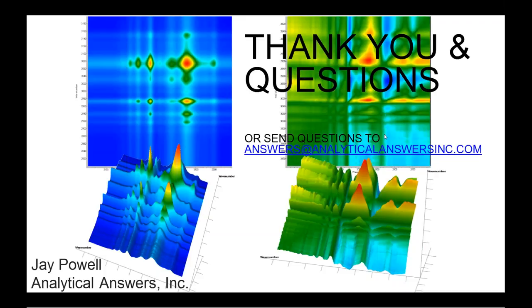I'm not seeing any further questions come through in the chat. Jay, do you have any final parting thoughts that you want to share as tips or caveats or just information people need to bear in mind? It was really informative and helpful to find out about bag wax and why we should not be putting our samples in plastic bags. Any further final tips for the audience?